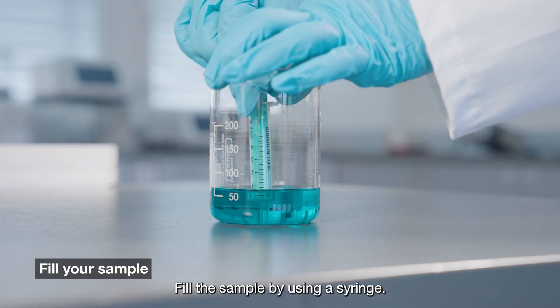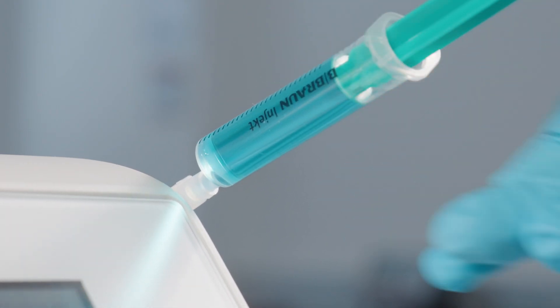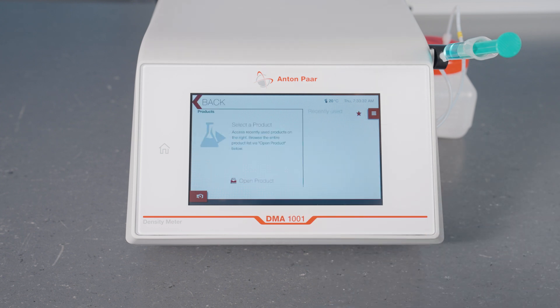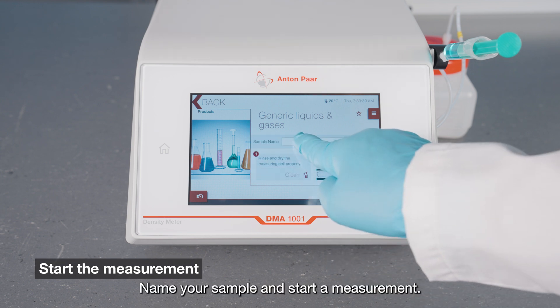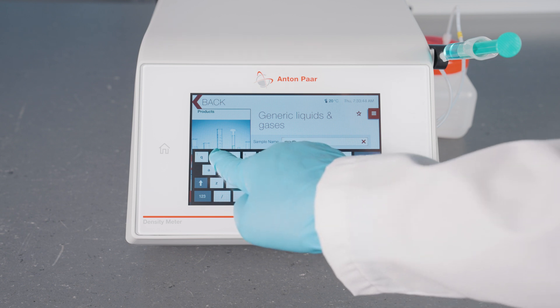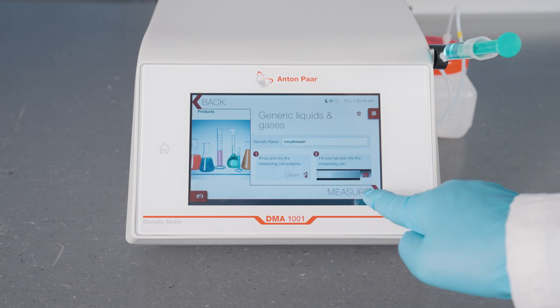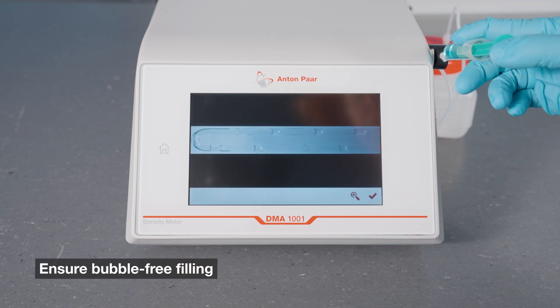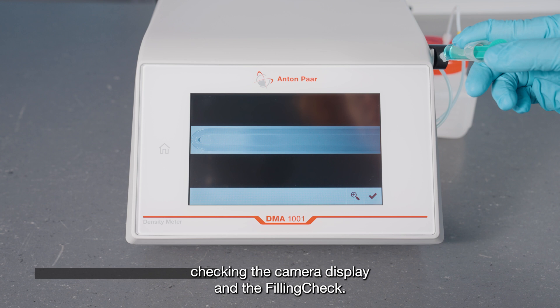Fill the sample by using a syringe. Name your sample and start a measurement. Ensure bubble-free filling by checking the camera display and the filling check.